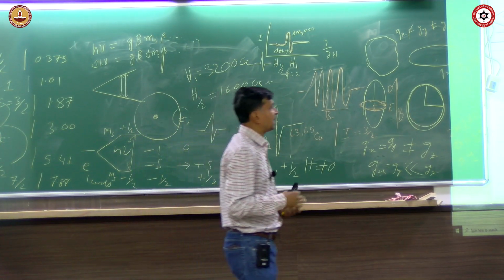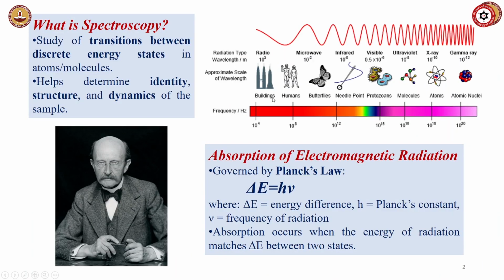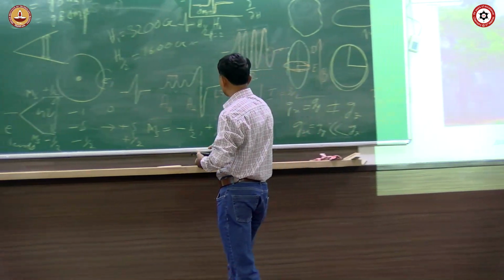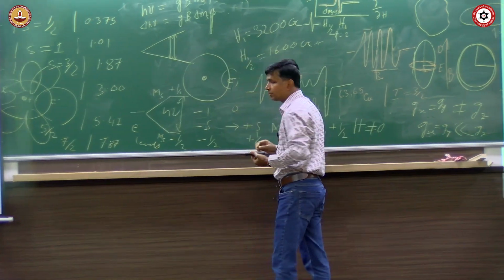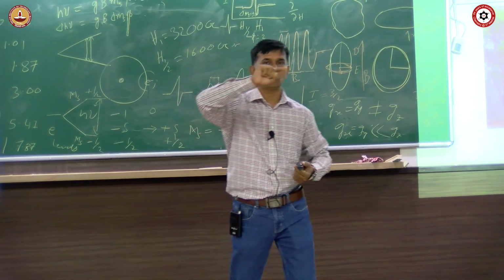So now too many lines and too many signals will come, and you will have to get a feeling for them. Okay. So we have given you the basic signal. Now I will explain another parameter. If I have an electron in free space, I get only one signal.